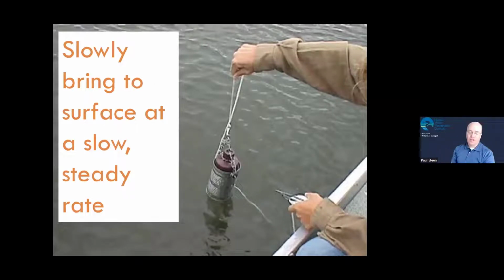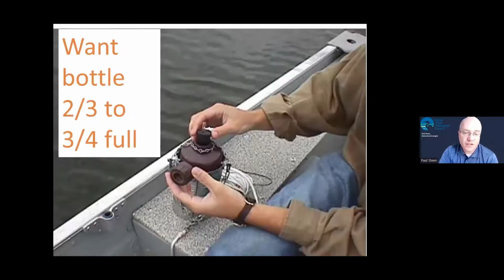Okay, when the line goes tight and you know you've gotten to the proper spot, you can slowly bring that sampler back up at a slow, steady rate. Now this will take some practice, but there's a way to judge how well you did when you slowly bring this up. That's because you check your water depth in this amber bottle.